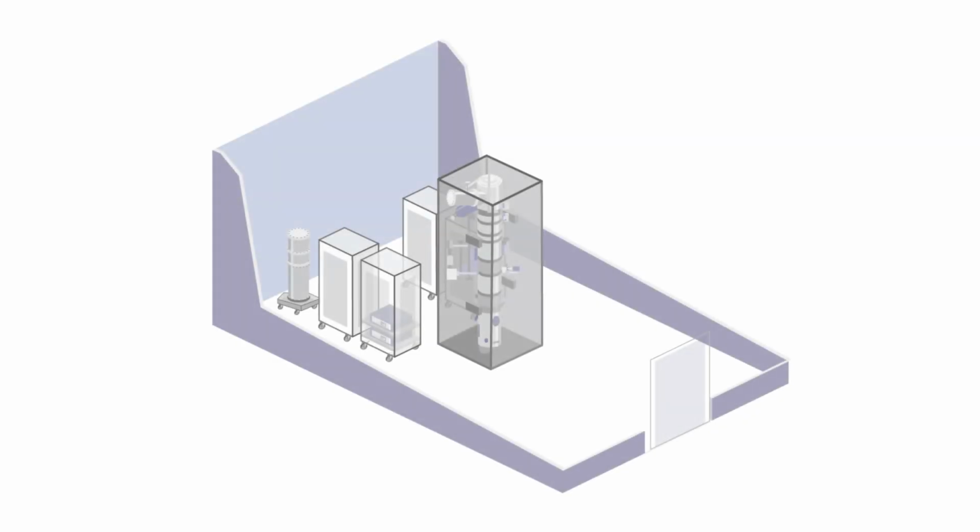The result is that these different magnetic fields, even if they're the same at the source, can be drastically different at the electron beam column, which is what matters the most. And so when we do our EMI modeling services for an engineer or a customer, we often provide results that are drastically different than what the electrical or design team was expecting when they gave us the plans to analyze.